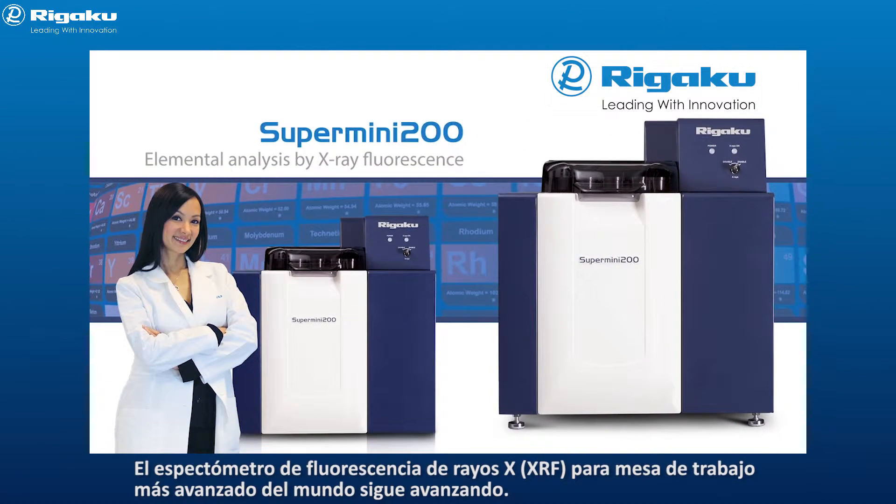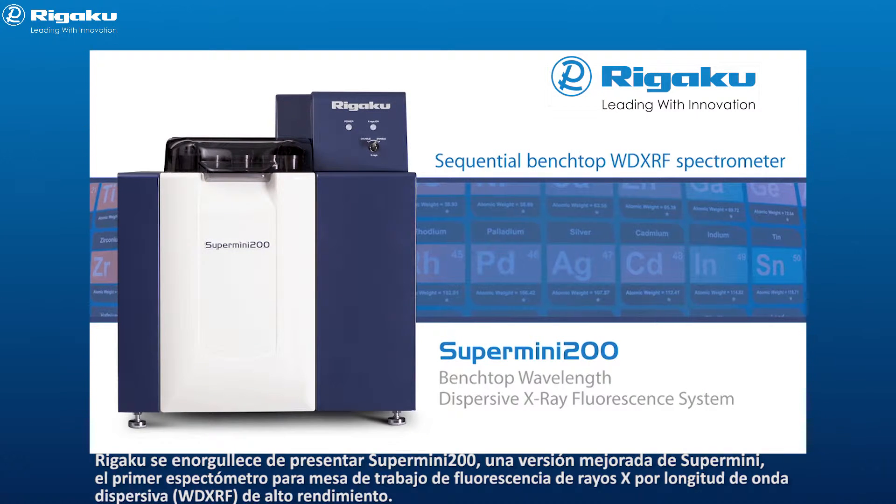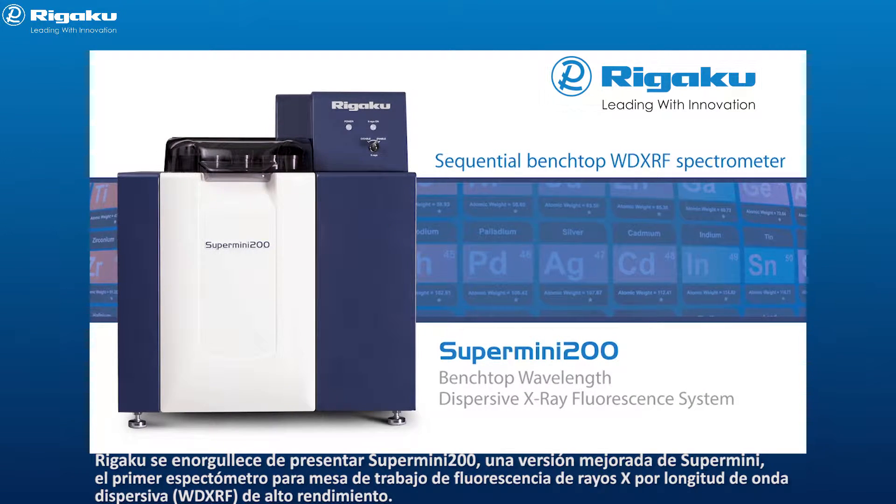The world's most advanced benchtop XRF spectrometer advances even further. Rigaku is proud to introduce the new Supermini 200, an improved version of the Supermini — the world's first high-performance benchtop WD XRF spectrometer.